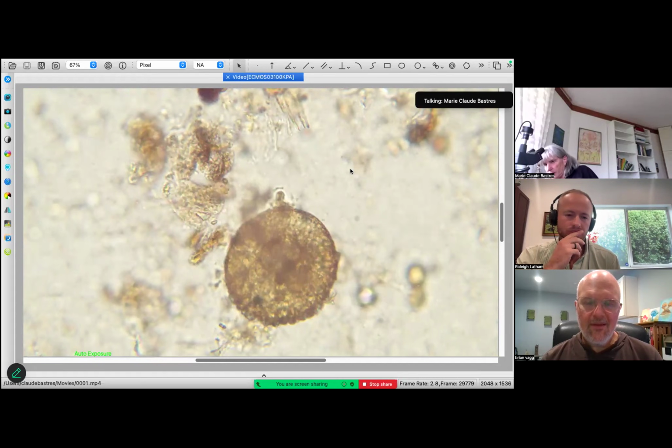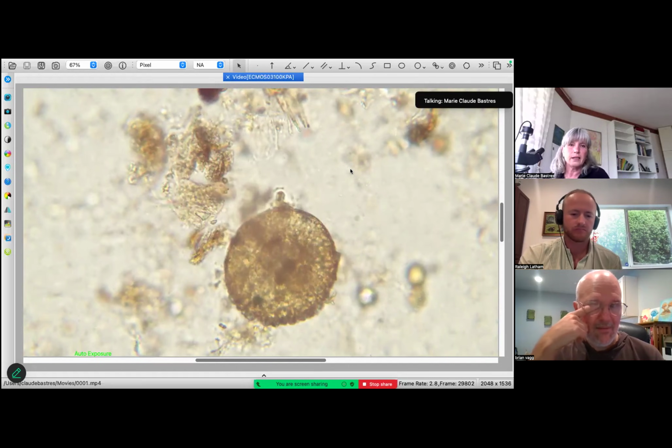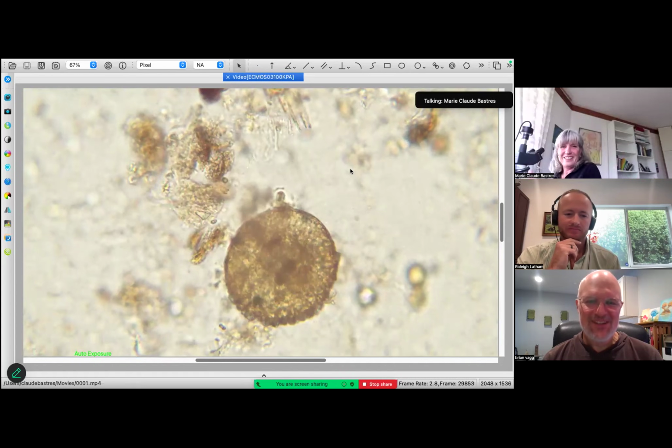Here we are at 400x, and I have seen others in central Chile which are full of crystals, and they look like princes, full of jewelry. But here they don't have so much because this is a compost, so not many minerals to decorate themselves.